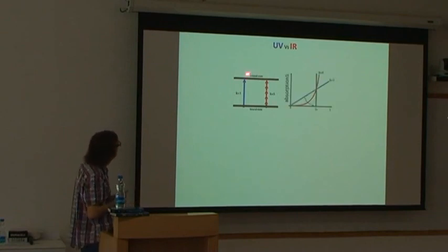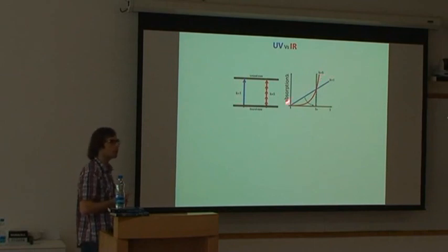So what happens is that the absorption with the UV will be linear, okay? While with the infrared, if you send 1, 2, 3, 4, nothing will happen. You have to go up to 5 at least to see an effect. So in this case, it will become threshold.